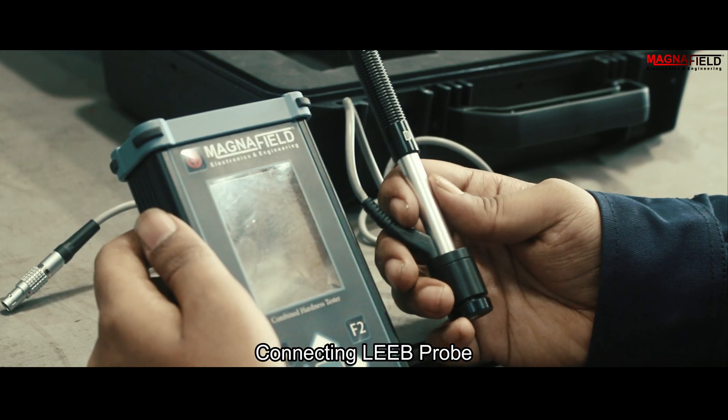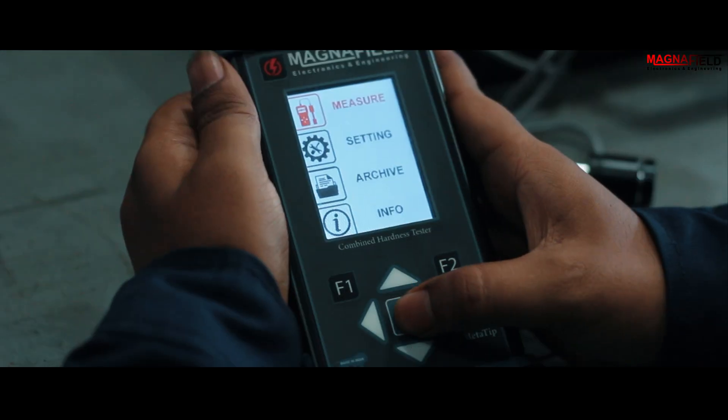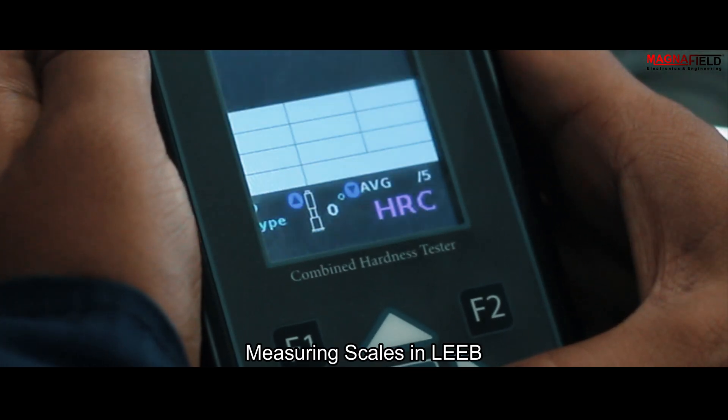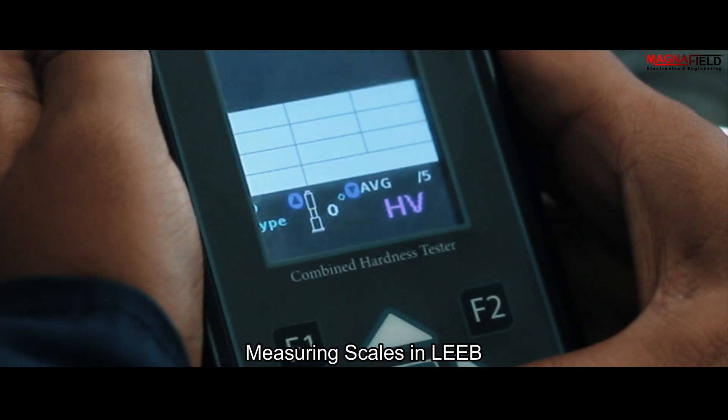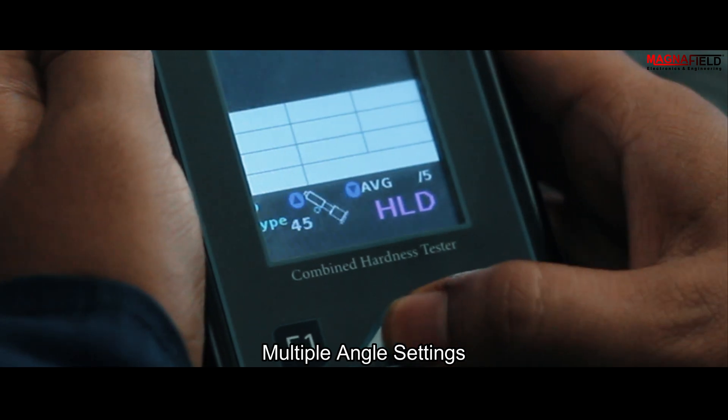Connecting Lieb probe. In Lieb mode, it can measure HL, HRC, HB, HV, HRB, and MPA. Multiple angles can be set.